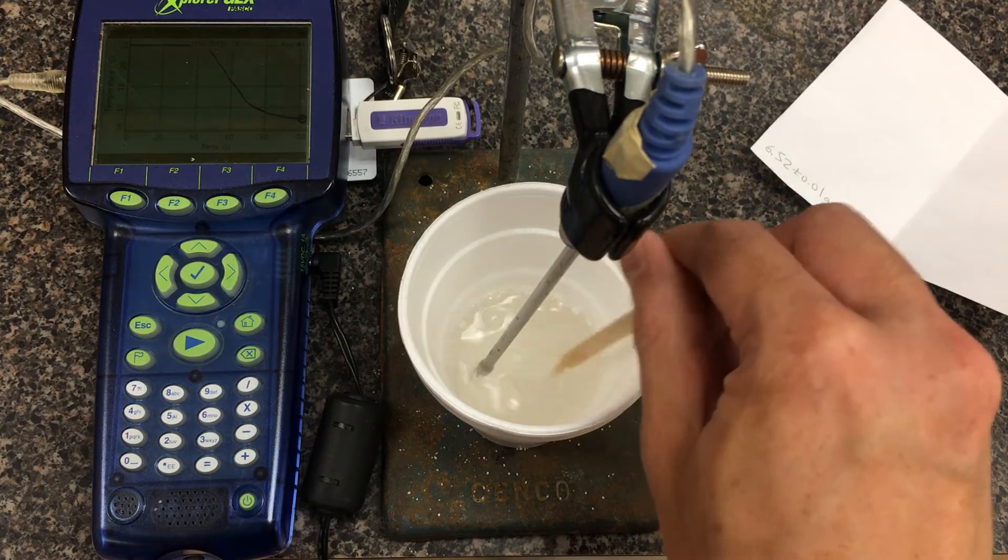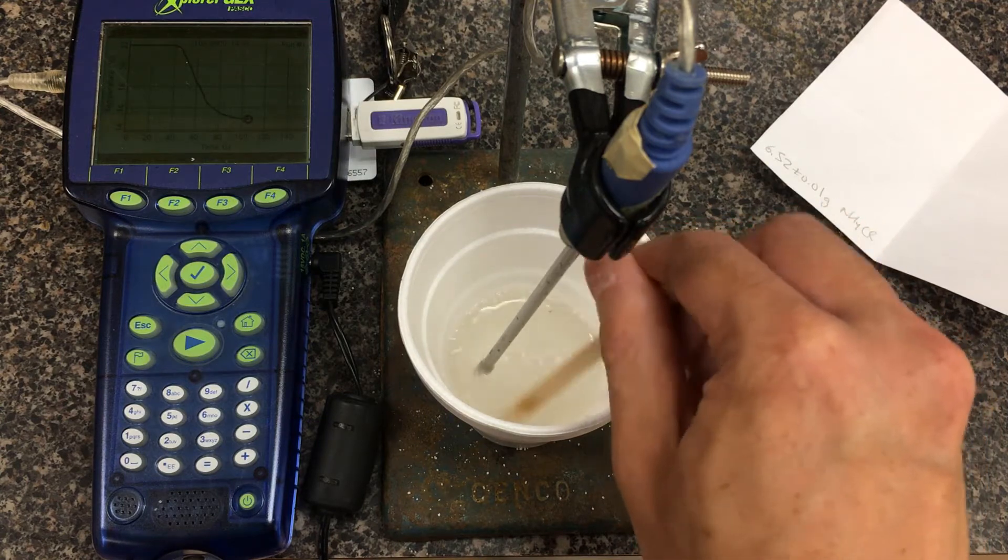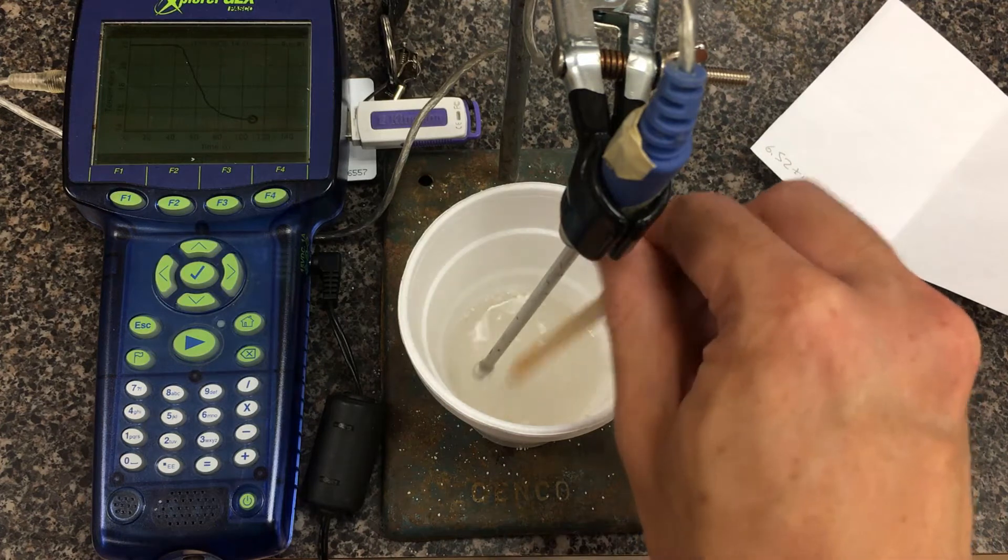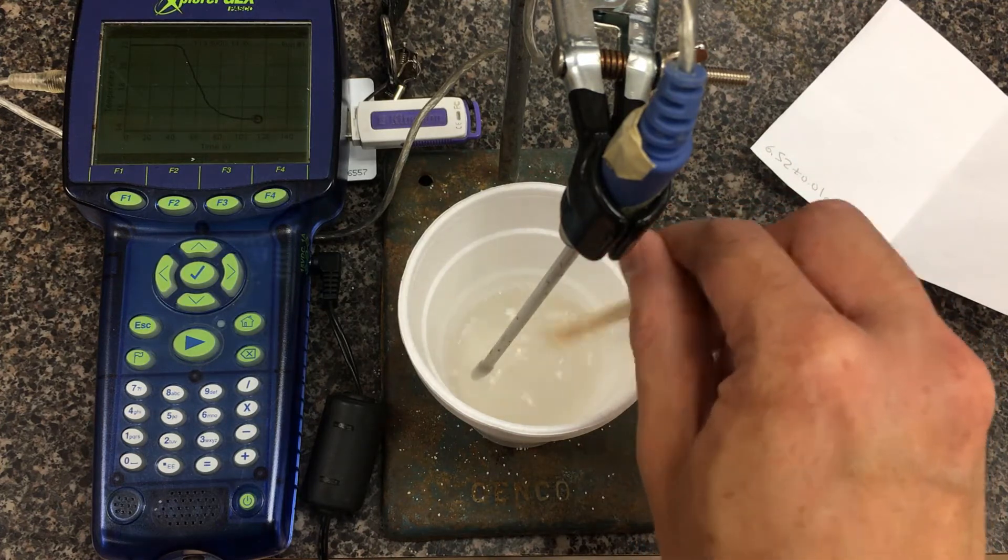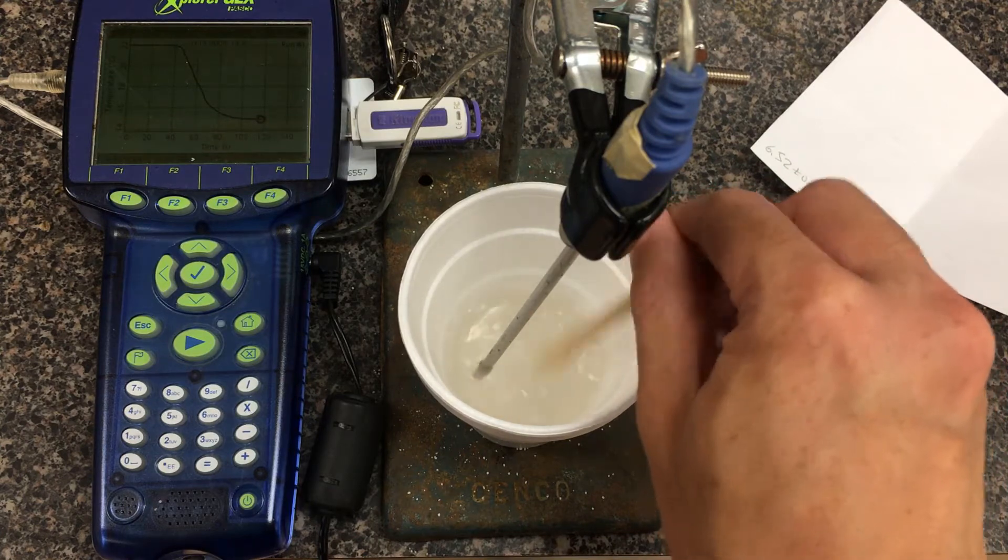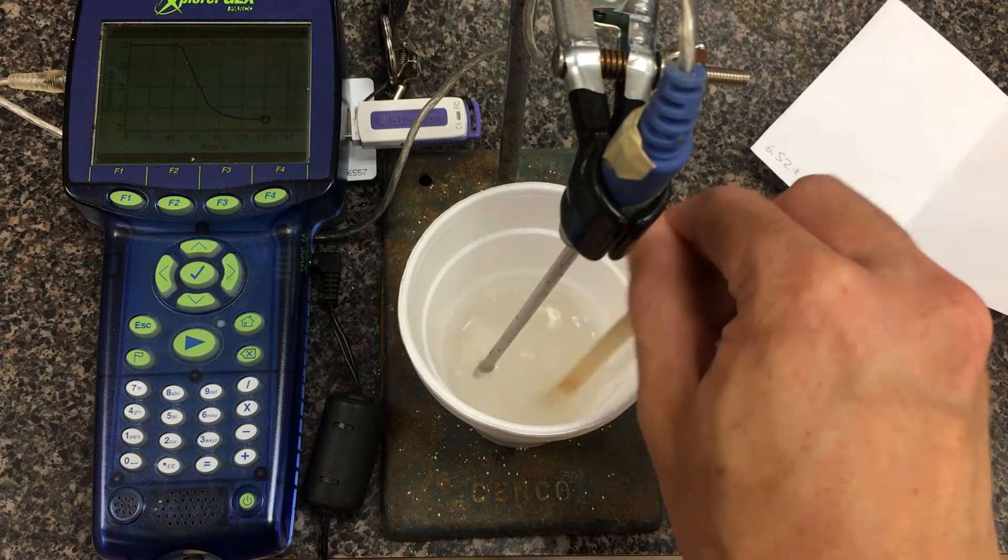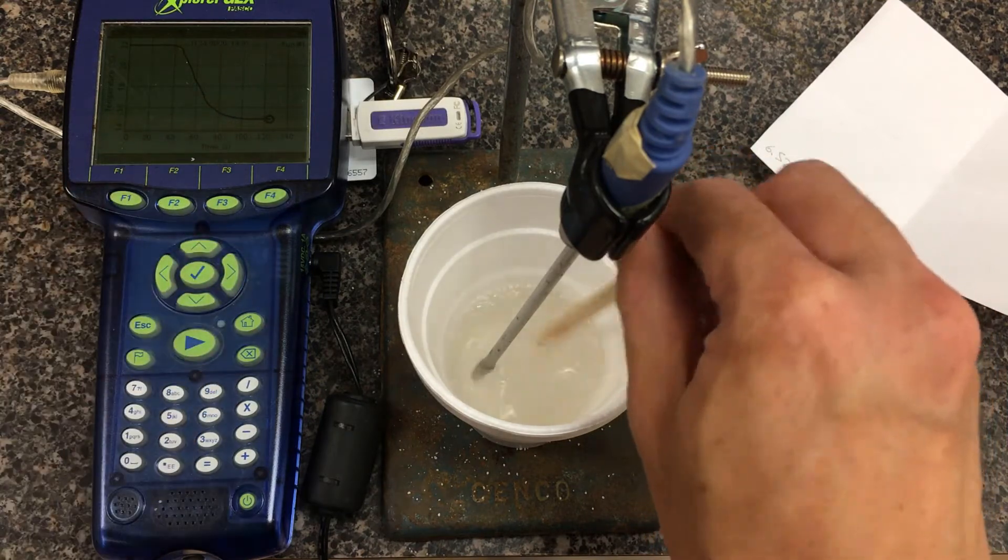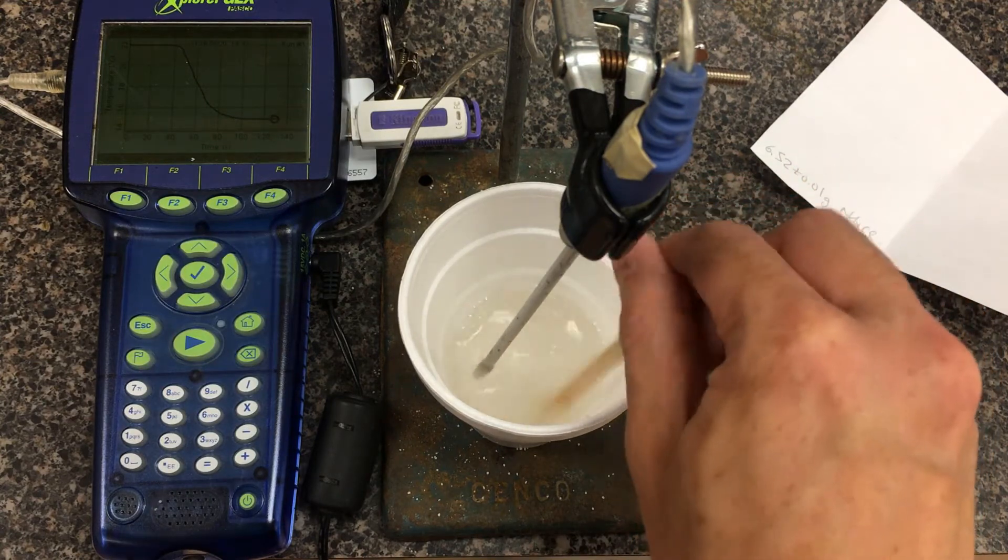Remember for a calorimetry experiment, the biggest source of error is heat loss to the surroundings. Even though we've used a styrofoam cup and a wooden stir stick instead of a glass stir stick, one major error would be not having a lid on top of the styrofoam cup. We're going to let it steady out to get a sense of it trying to equilibrate back to room temperature. That slope is what we need to do the extrapolation later.